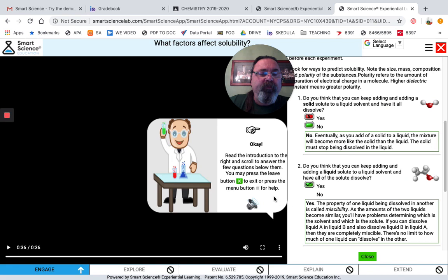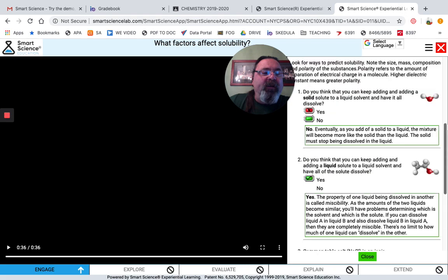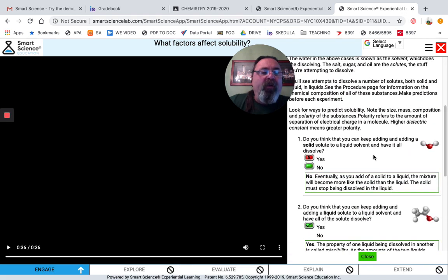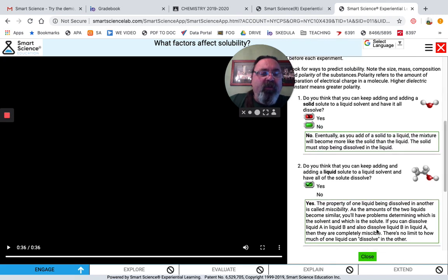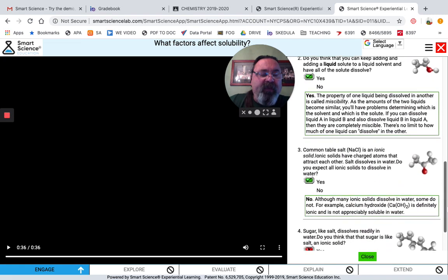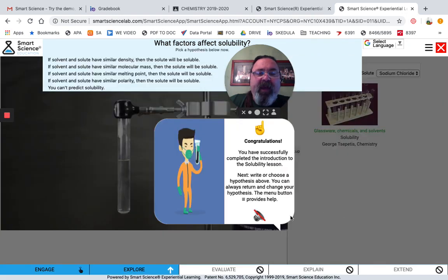Read the introduction to the right and scroll to answer the few questions below them. You may press the leave button to exit or press the menu button for help. What I wanted to point out here is that although the scores have been submitted, it does tell you which ones they got. The student will be shown which are correct and incorrect, so they can go through that. Once they close that, they follow the next process.